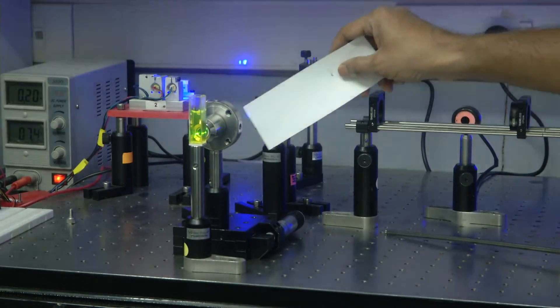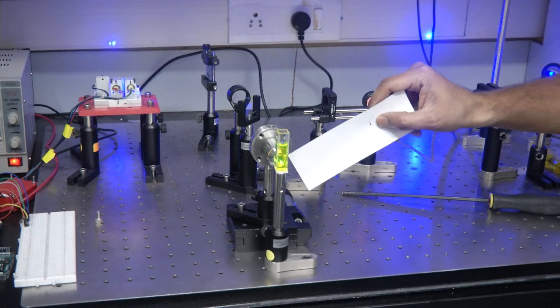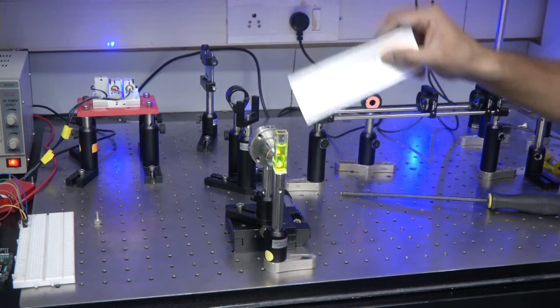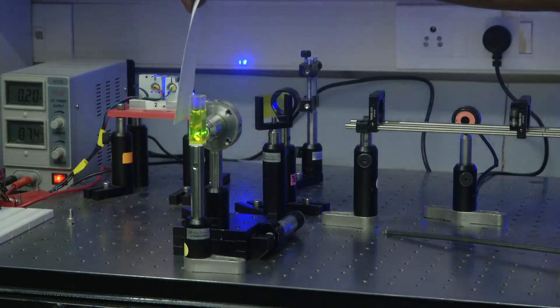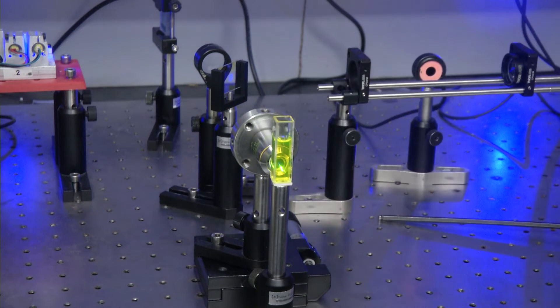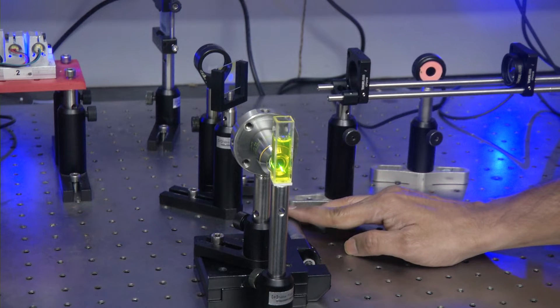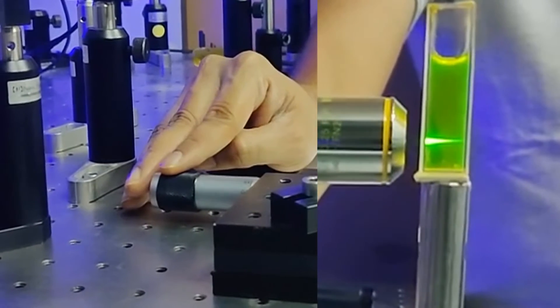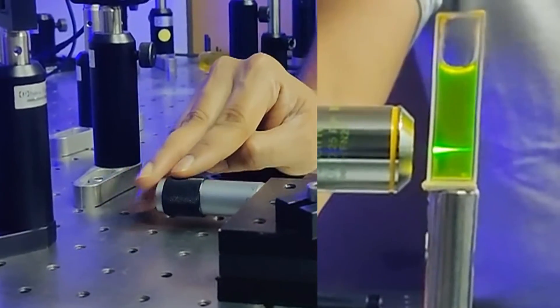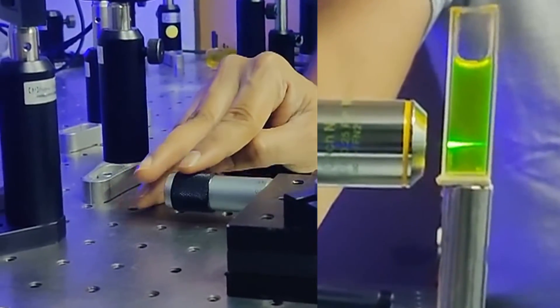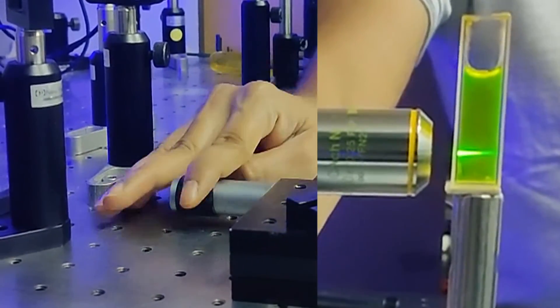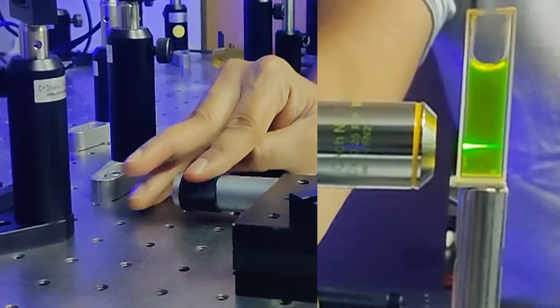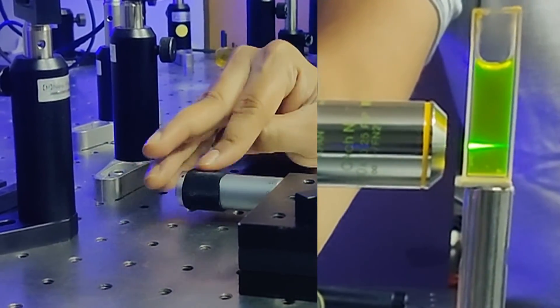From here the light entering through the objective starts to focus and you can actually see the wider beam towards this end of the objective becoming thinner and then later becoming wider again. Now how do I know that it is actually the focus? You can actually move the relative distance between the objective lens and the cuvette. If it is the focus, what you are doing is you are taking the objective lens back, you are taking that thin beam closer towards that wall.